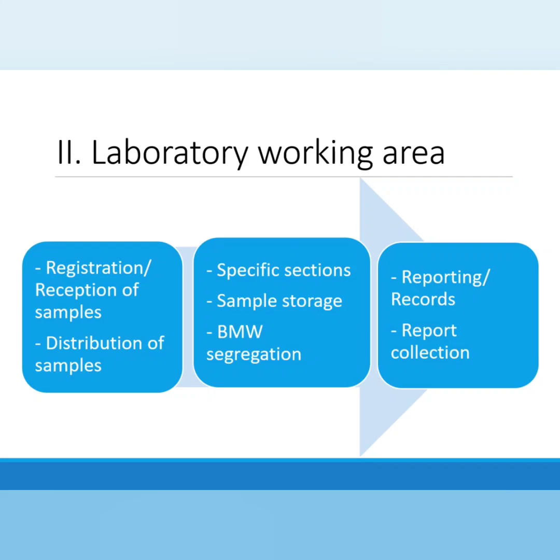An area must be demarcated where the biomedical waste generated in the different sections is collected and temporarily stored until transported to the temporary storage area of the whole hospital.